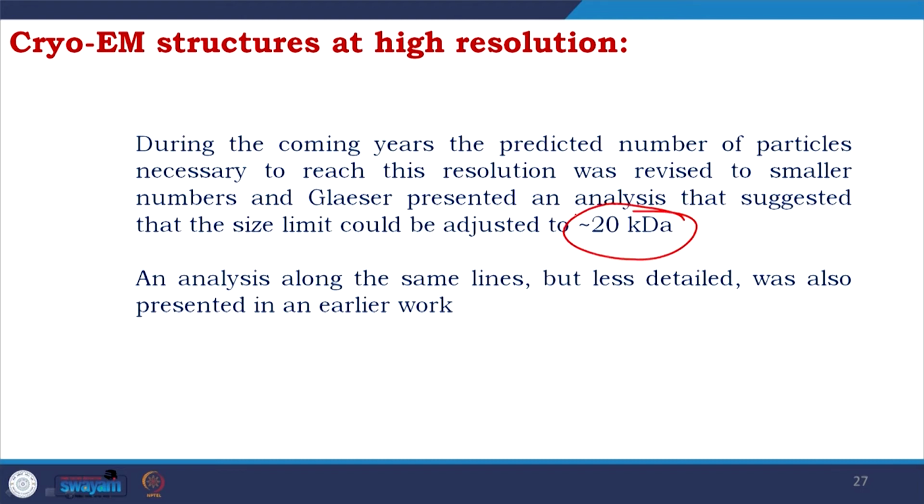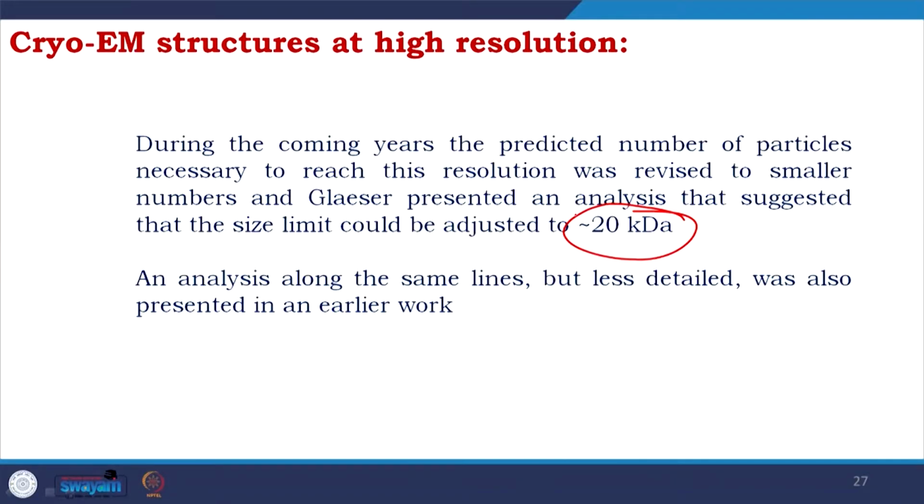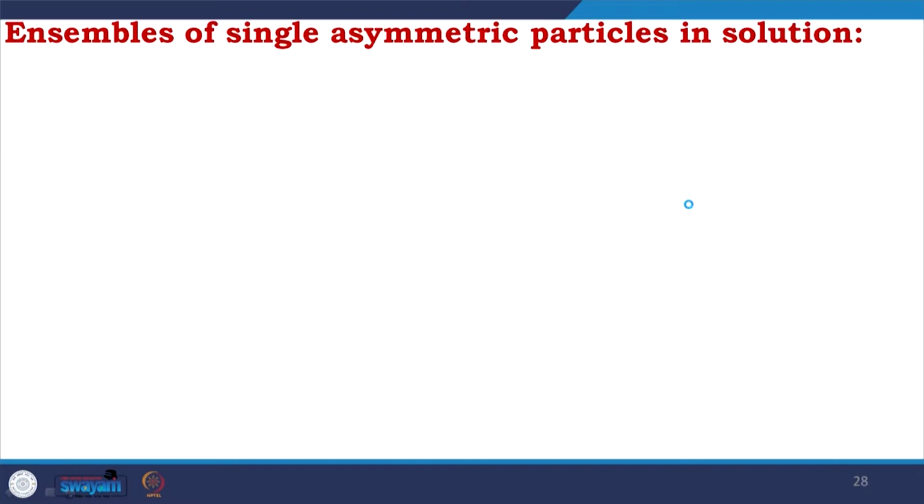If this is possible, cryo-electron microscopy will again be prospering, getting more coverage in drug designing and all these things. An analysis along the same line, but with less detail, was also presented in earlier work, giving the possibility of lower molecular weight protein structure determination.